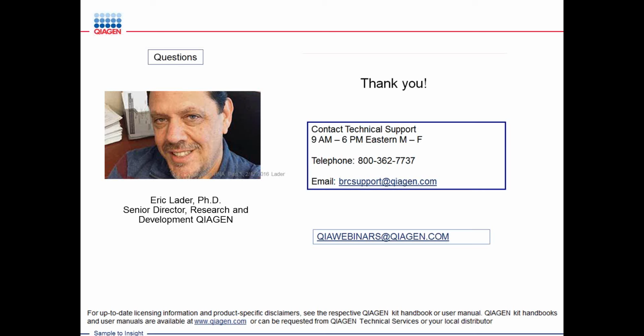But if you look, time after time, at the samples we're getting, we can easily make a library from FFPE. And when we multiplex those libraries on the instrument, because we're normalizing the library onto the flow cell, we're getting the same number of reads. Every library gives us 2 million reads. But a fresh sample, from a 2 million read library, will give us 1 million barcodes, and an FFPE sample from a 2 million read library will give us 5% of the barcodes.